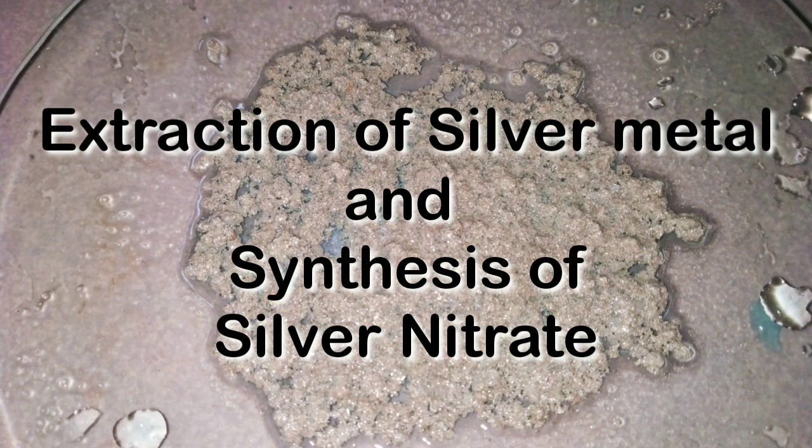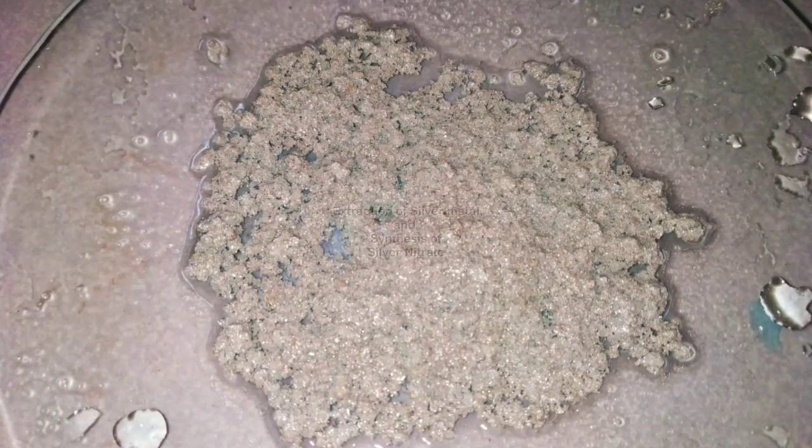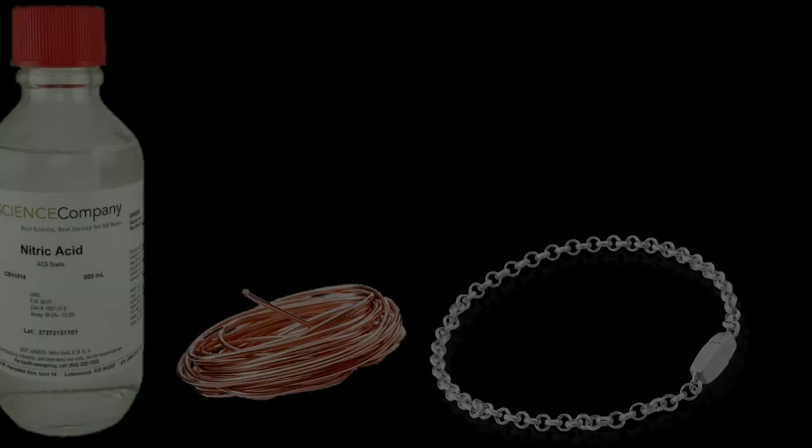So friends, today we will be extracting silver metal from a silver jewelry and I will then make silver nitrate from it.